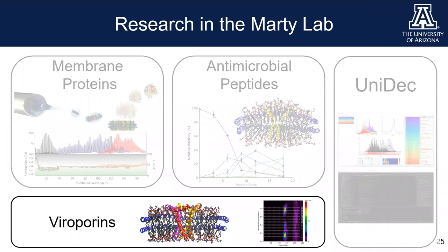We did some work with SapA, these not quite the picodiscs, but we were making slightly bigger particles than that. And they give really nice spectra, but they had multiple different versions of the belt stoichiometry. So we'd see some with 4 SapA, some with 5 SapA, some with 6 SapA. And so it's a little more complex to analyze when you have those sort of multiple distributions going on. Yeah. Thank you.